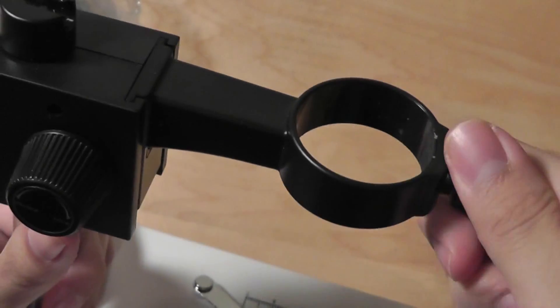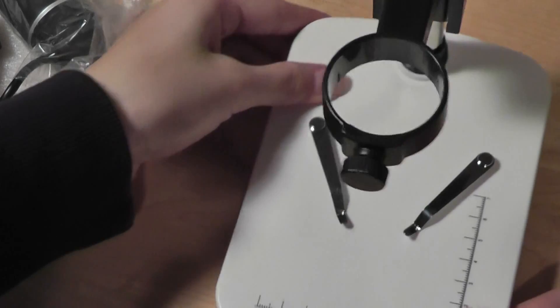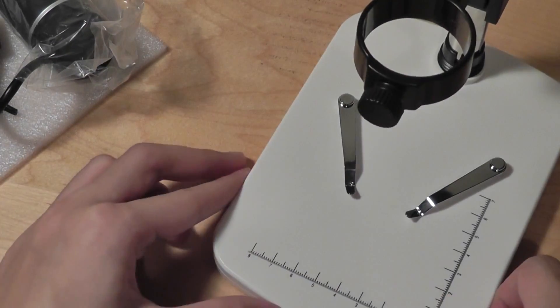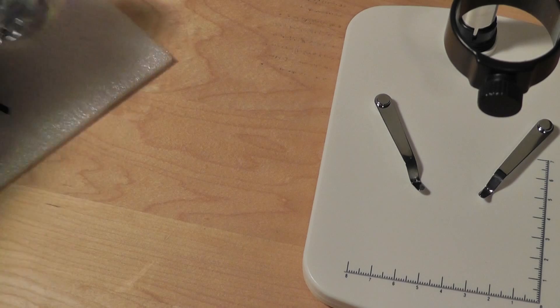So you have quite a bit of adjustments you can make. You can also tighten or loosen the top to fasten the microscope into place. Overall, it's a pretty professional setup. It doesn't take up too much space, and you can also fold it down for portability and storage.